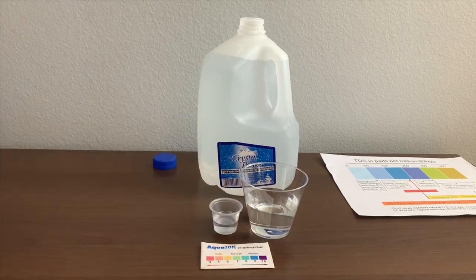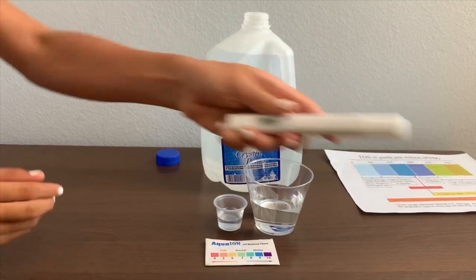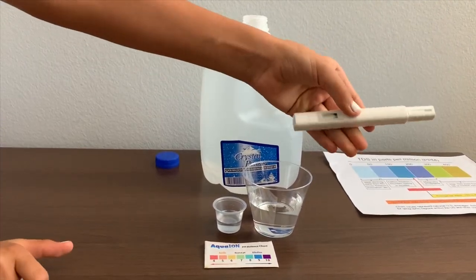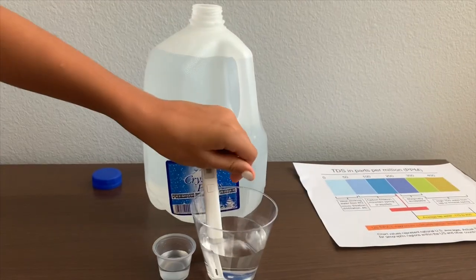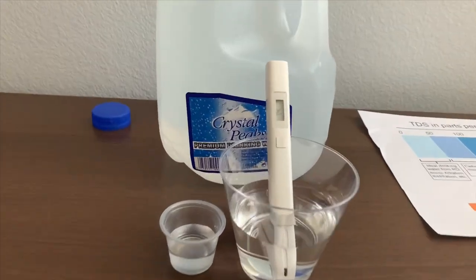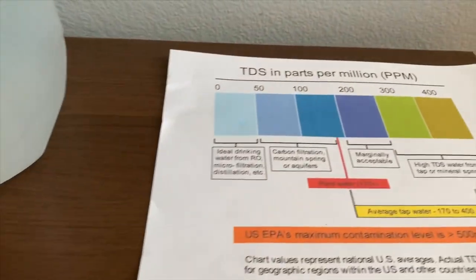First we're going to test the TDS level. If you want to buy this TDS tester, check the link down below. Turn on the TDS tester and make sure it says zero, then put it in. Let's wait.